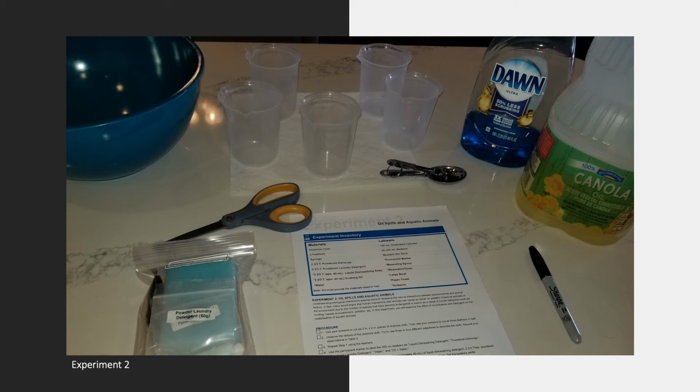Now we're going to move to experiment 2. So if you would please get out the protocol or the procedure for experiment 2 and follow along with me. In this experiment, we needed quite a few more supplies, but they're all listed there for you. The majority of those are supplied in your kit, but there's a few others that we had to supply ourselves, like cooking oil, scissors, and liquid dish detergent. You'll notice that there's a baggie on the bottom left, and as you may notice in your kit, some of the contents may be loose, but sometimes you'll find baggies of multiple components.